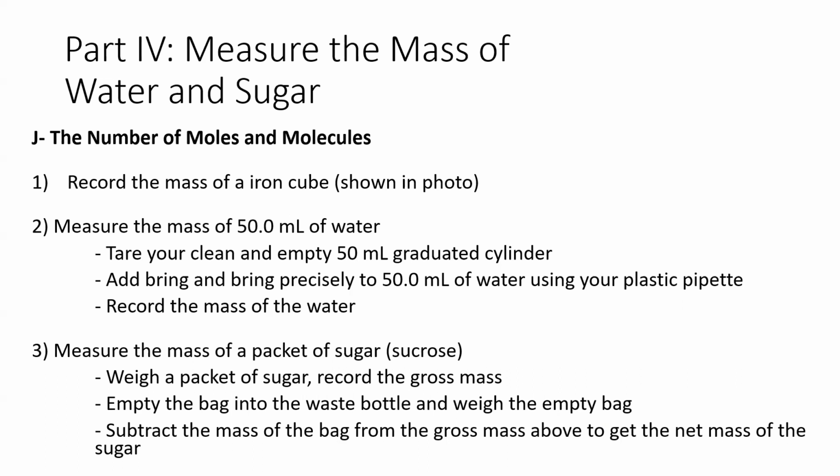For part 3, we're going to measure the mass of a packet of sugar or sucrose. The packet of sugar is given to you in your materials from Miramar College. You're going to weigh the packet of sugar, which includes both the packet and the sugar inside. And this is going to be your gross mass.